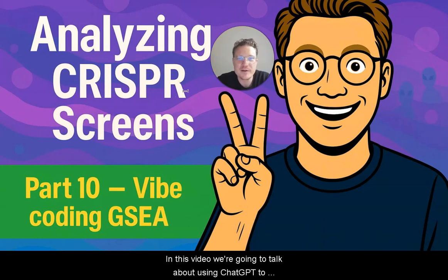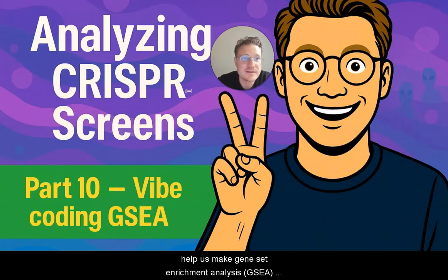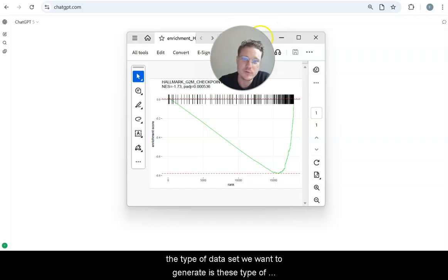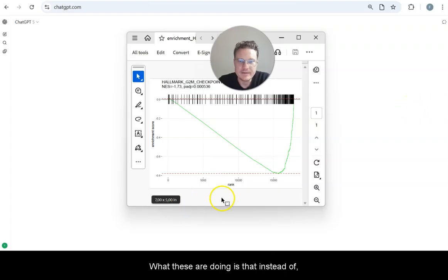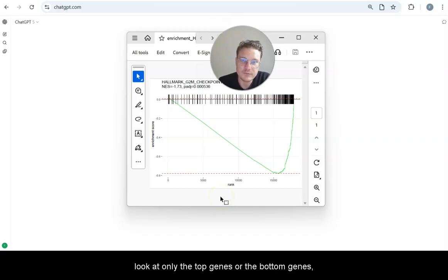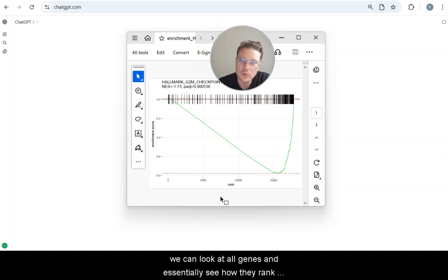In this video, we're going to talk about using ChatGPT to help us make gene set enrichment using this fancy term, vibe coding, as is popular nowadays. And the type of data set we want to generate is these enrichment plots that you'll see from gene set enrichment. What these are doing is that instead of, as we've done in all the other videos in this series, looking at only the top genes or the bottom genes, we're going to look at all genes and see how they rank from highest to lowest, for example.